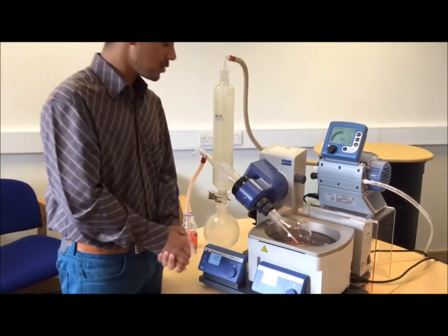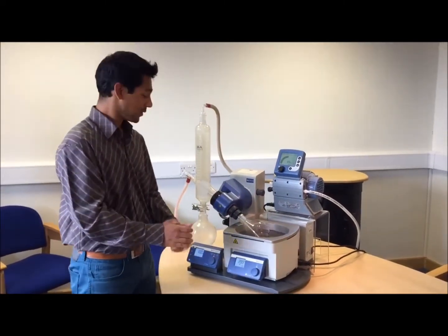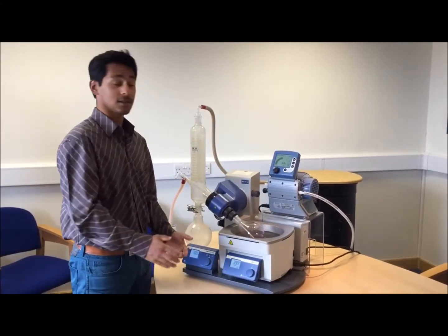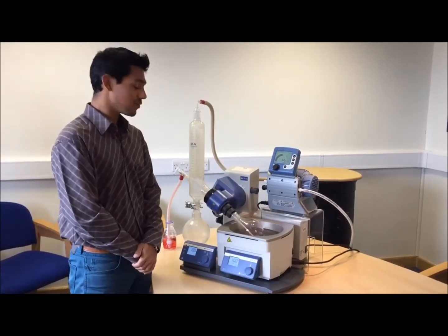You're going to get a nice continuous process, which takes some time out of the process that you're going to use for evaporation. It's a nice little feature I would like to talk about.